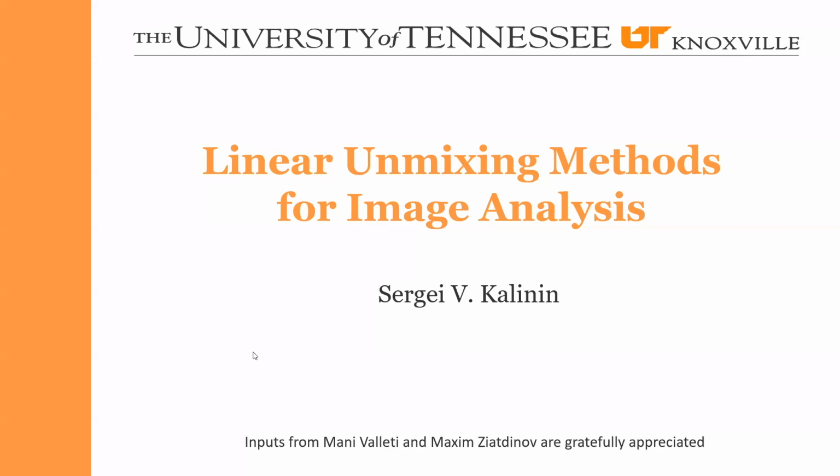Morning again, and let's dive directly into the application of machine learning, namely the linear unmixing methods for image analysis. During the first lecture in this summer school, I illustrated that we can use machine learning on all the stages of the microscopy operation.